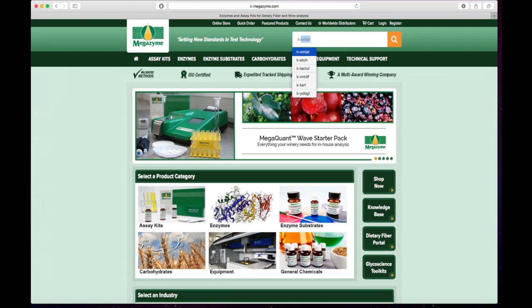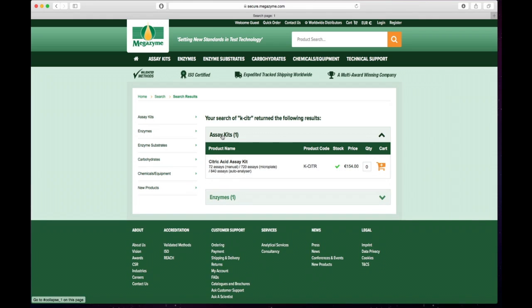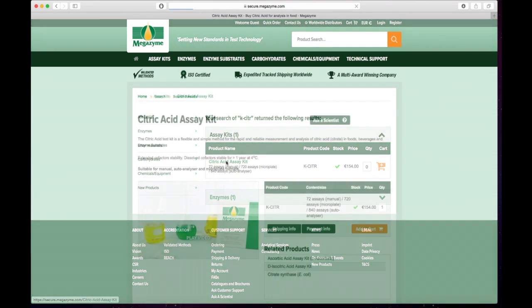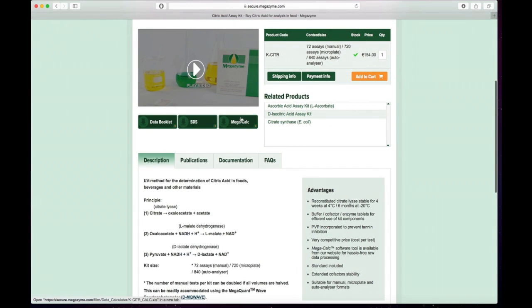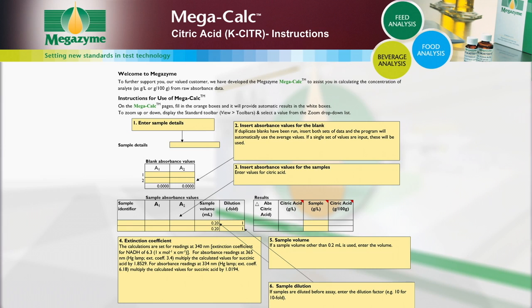Megazyme has also developed specific Excel-based Megacalc applications for each Megazyme kit to allow quick and easy results analysis. Results can be analysed using the Megacalc application specific to this citric acid kit, which is available to download free of charge from the Megazyme website. The Megacalc spreadsheet provides full instructions for use.